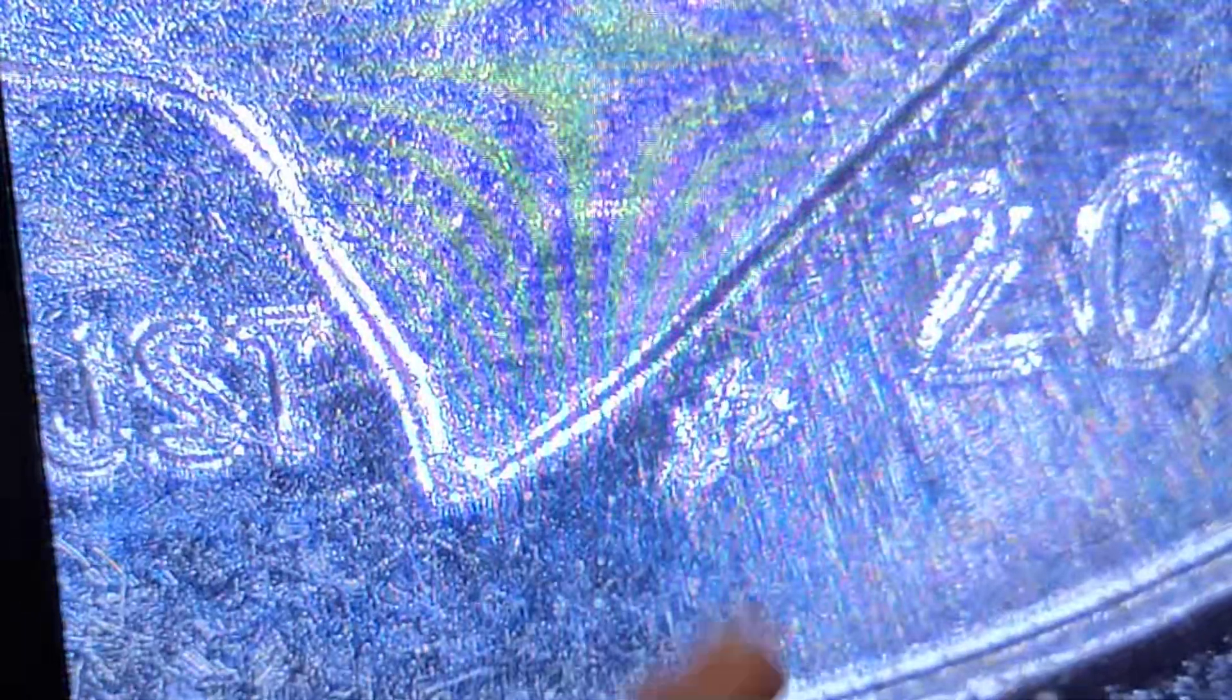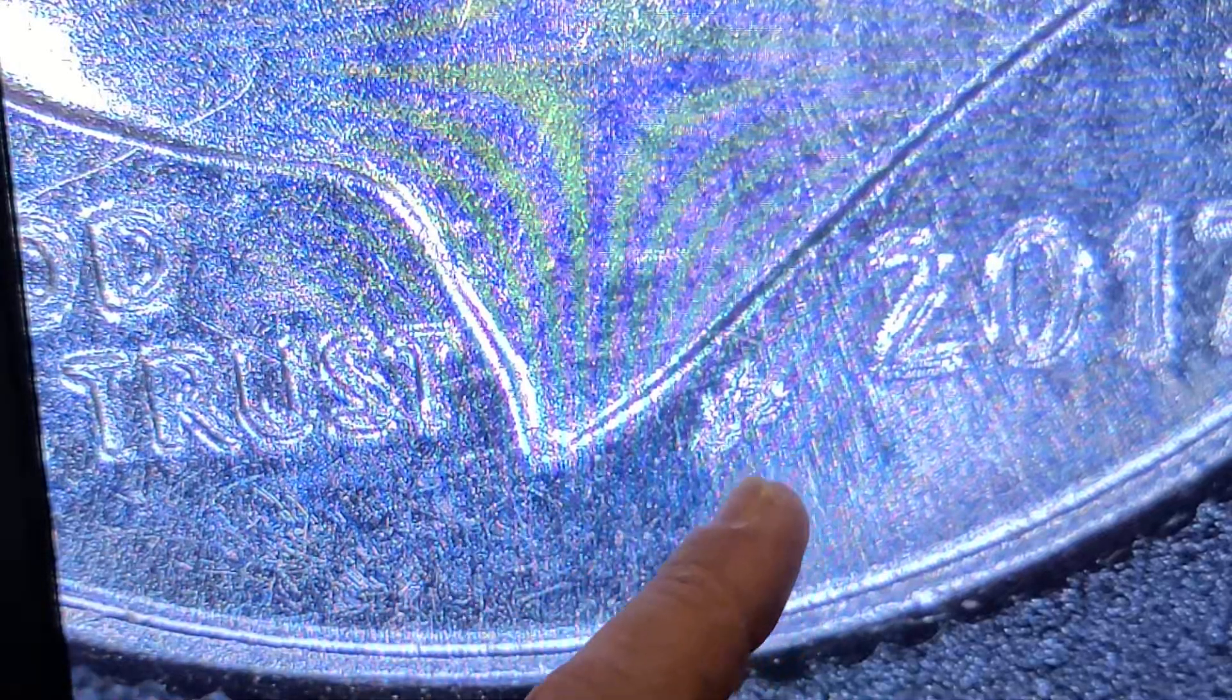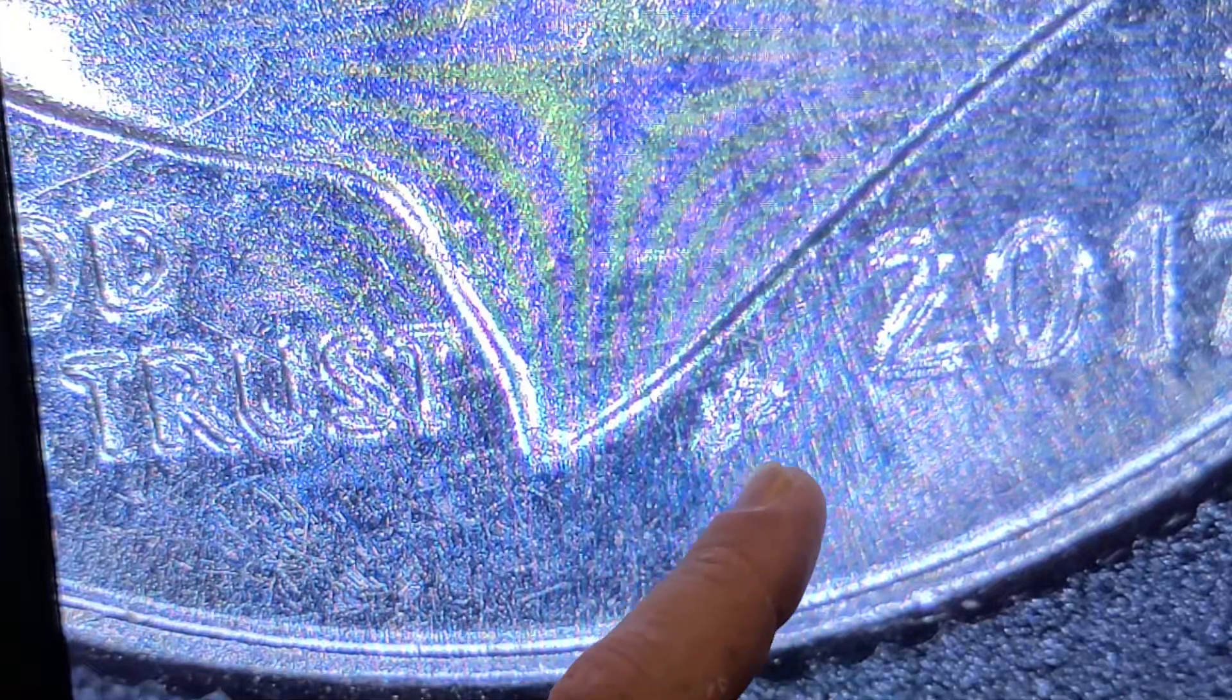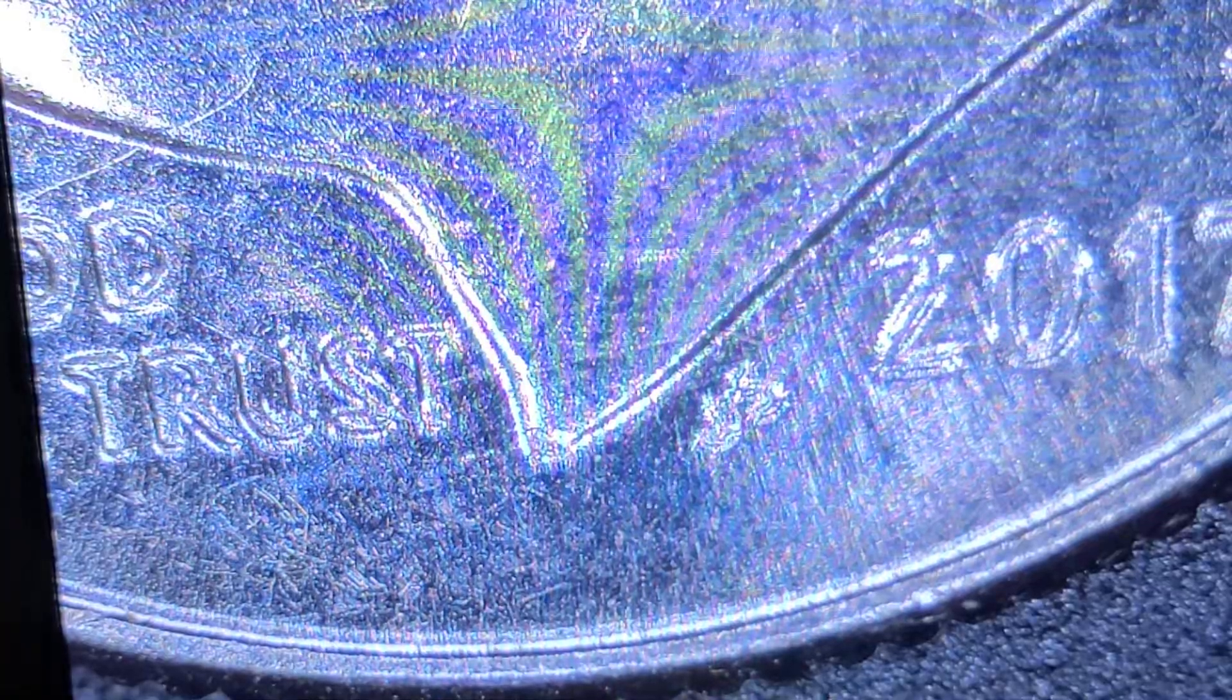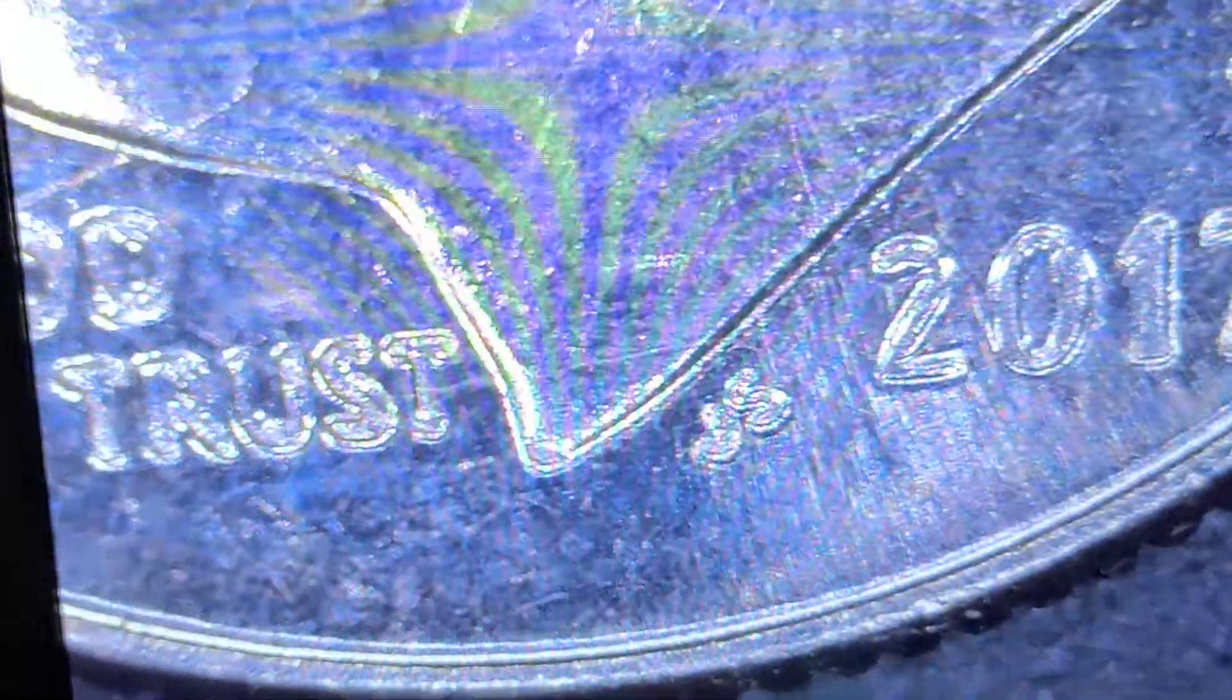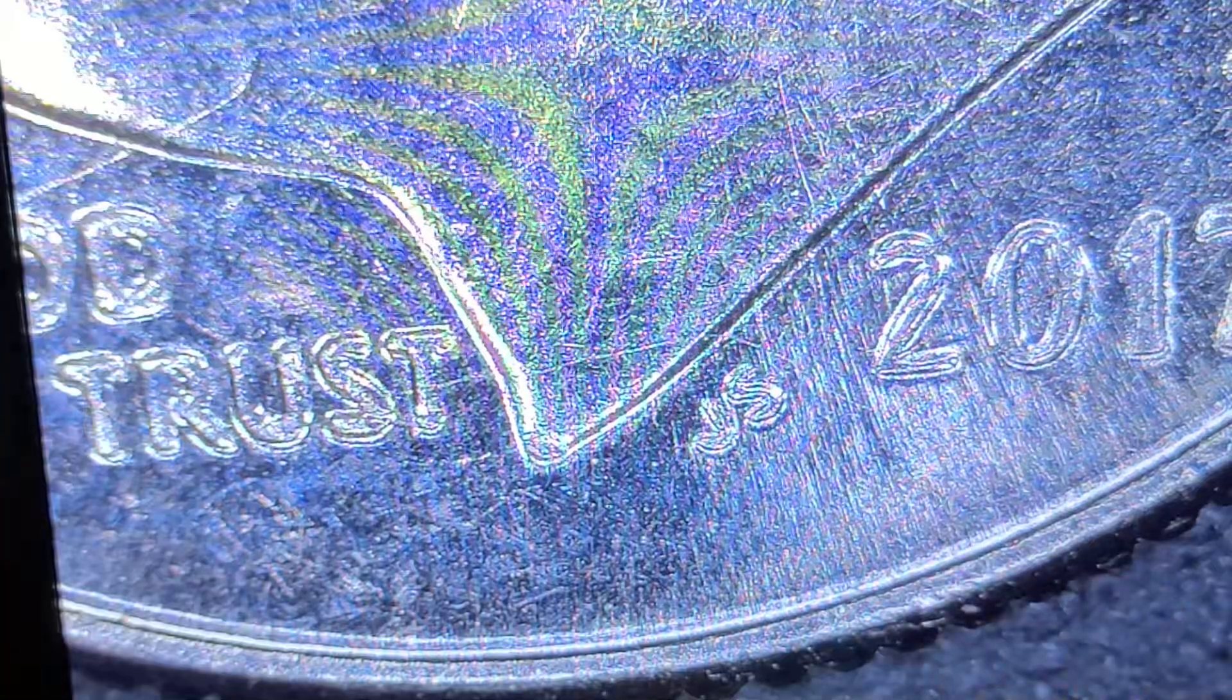You can see a bit of the pattern from recording the screen. This is not zoomed and then we'll just go up. The thing about the 3.0 zoom is it's getting a little digitally soft around the pixels, but if you're not super close to the screen it's actually kind of handy to have it zoom in that much. Two times zoom on top of its optical is where it still stays pretty sharp. We can even see the little artist mark on this US dime, that little JS there. You can't, it's barely even visible, just looks like a little nick on the coin or something. We can see some of the patterns, just the scratches on the material. Because of our depth of focus we can actually get more crisp on the higher sections or down in the depressed area.